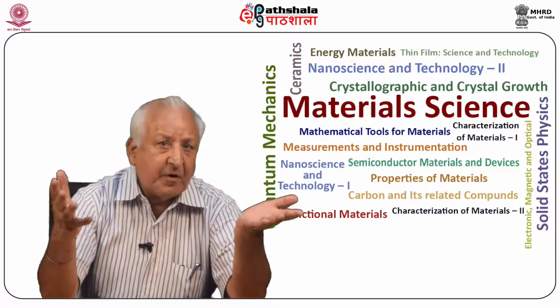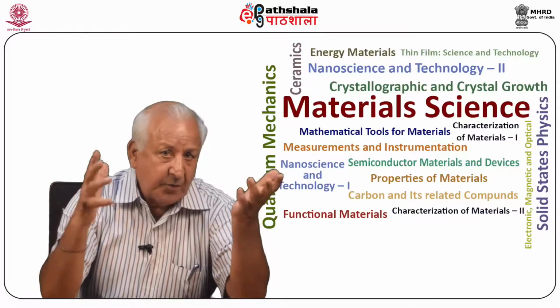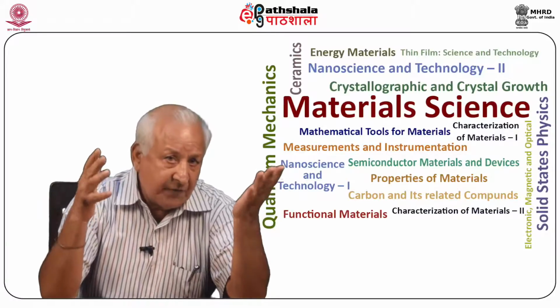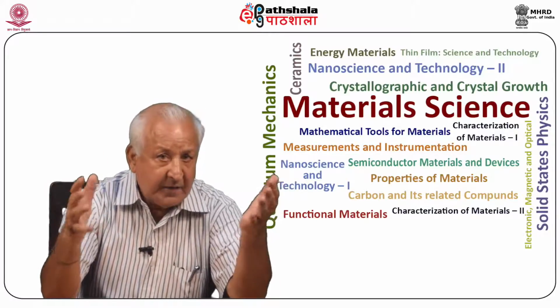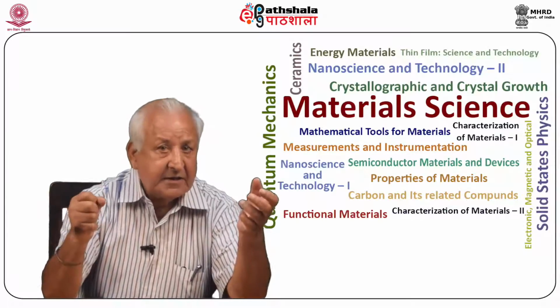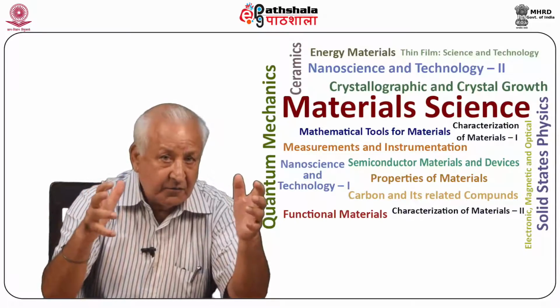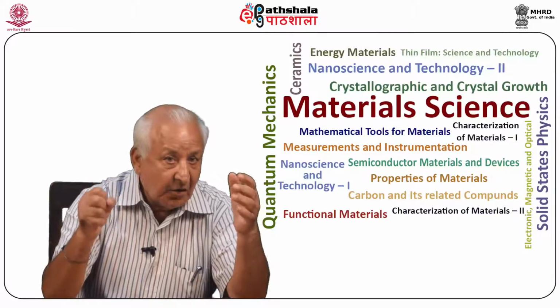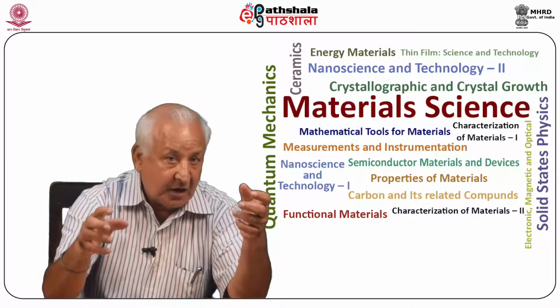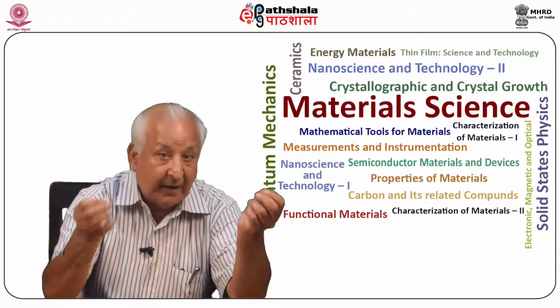Now we take up examples of topographs and diffraction curves. X-ray topography is applied in transmission or reflection geometry in order to make assessment of perfection and investigate defects in crystals. Generally, a diffraction curve or a rocking curve is also recorded before taking topographs. X-ray topography is a preferred technique for studying the crystal defects in bulk.